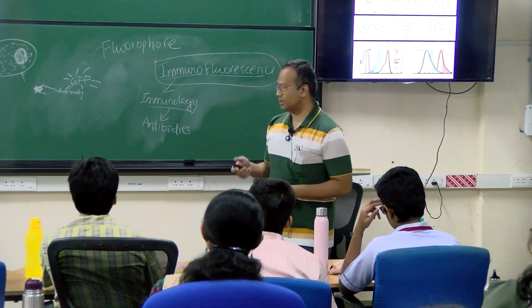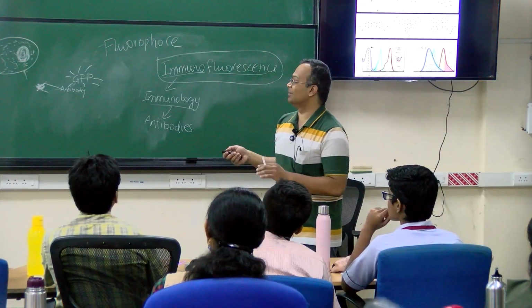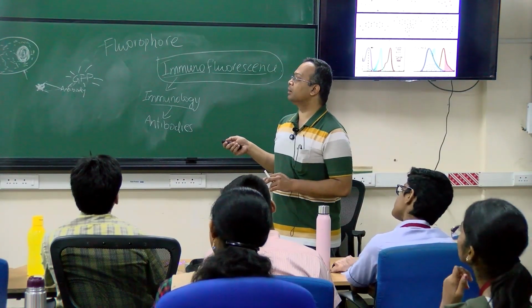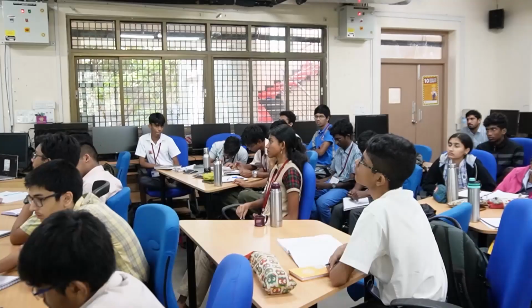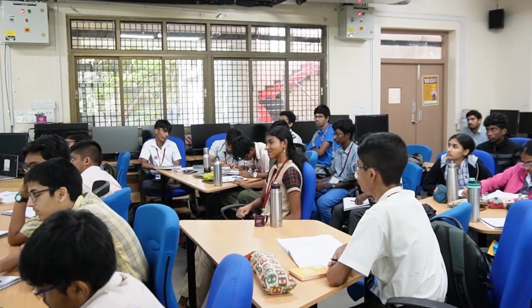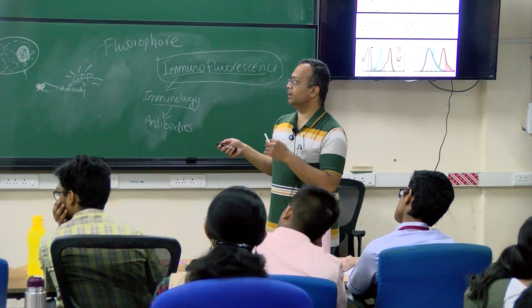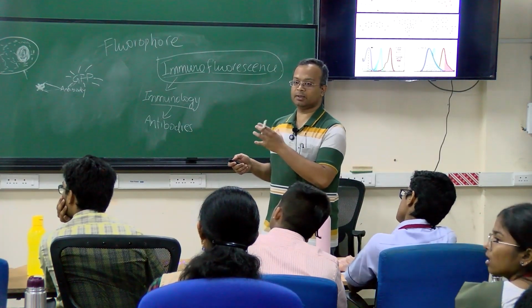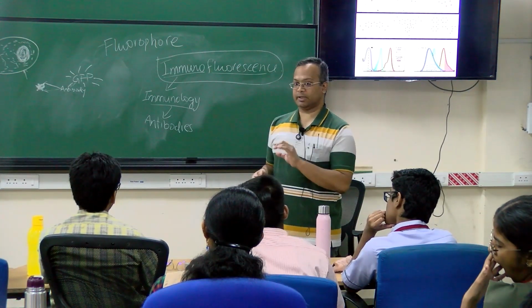That is a chemistry question, so I don't know the answer to it because I am not that much into chemistry. But whenever photons fall on these molecules, they have their vibrational states in such a way that these molecules transfer their energy. Let's say a photon falls on a particular molecule. Depending upon their vibrational states, the energy gets transferred to other molecules, and there is a temporary reconfiguration of the molecular arrangement, but only for a few nanoseconds.